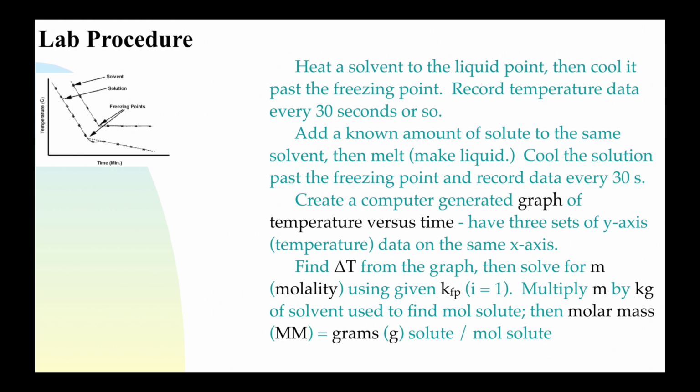Once you have all this data, then you need to create a computer-generated graph, and it'll be temperature on the y-axis and time on the x-axis.